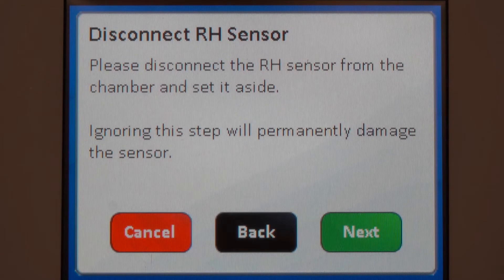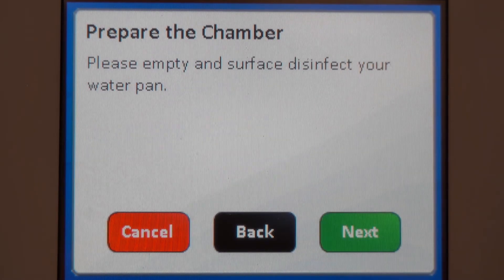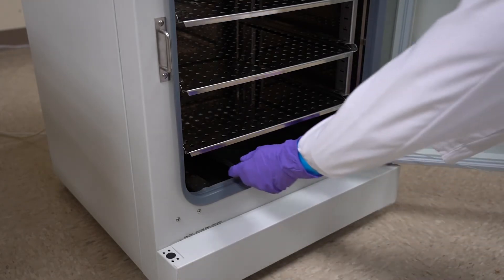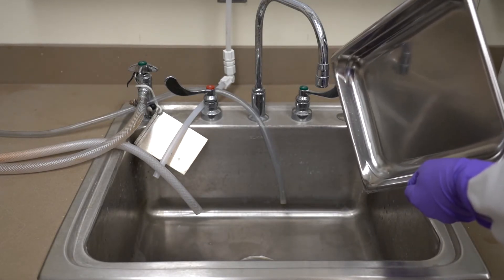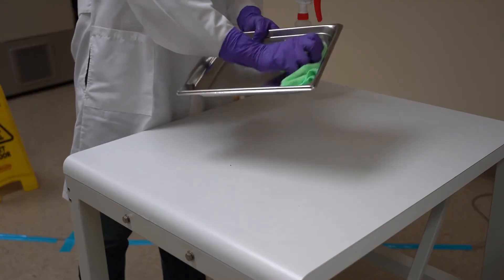Note that you do not need to remove the CO2 sensor, filters, or O2 sensor if your incubator is equipped. Be sure to use non-corrosive cleaning agents.